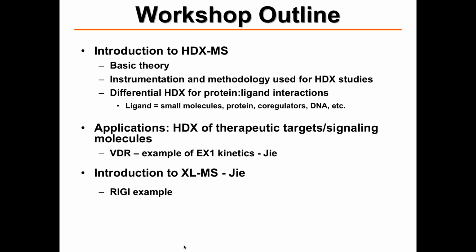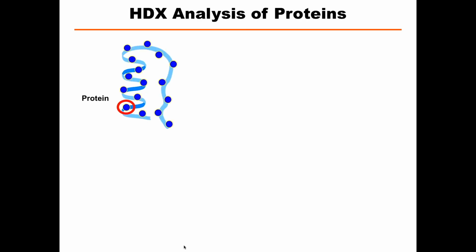We don't have any real live demos other than the EX1 one. He's going to walk through some EX1 calculations on some Excel worksheets. The reason for this is that the HDX software that we use is PC based, and it requires a very specific configuration on a PC to actually work efficiently. Otherwise, it would have been completely useless for a demo. And unlike the cryo situation, where there's software that works with all cryo data, mass spec software typically works with vendor-specific instruments. What I would show you, what we're using, would only work for Thermo instruments, and if you had Waters instruments, it wouldn't work necessarily. So we just decided to eliminate that.